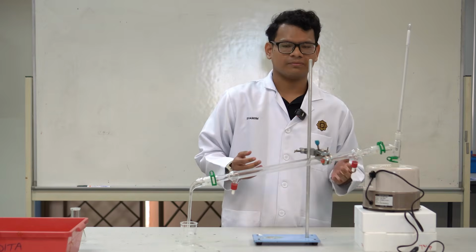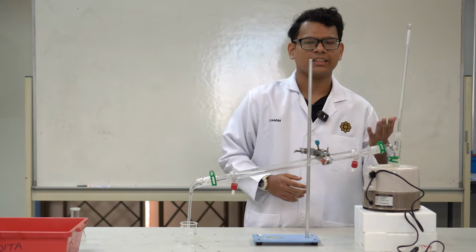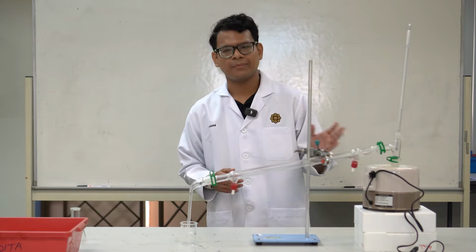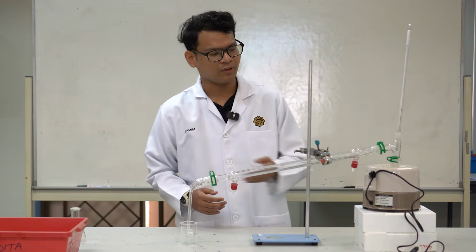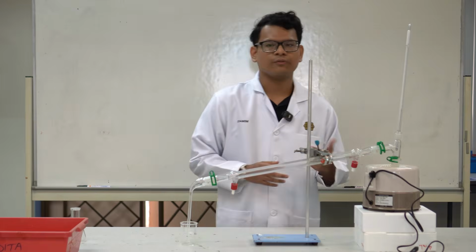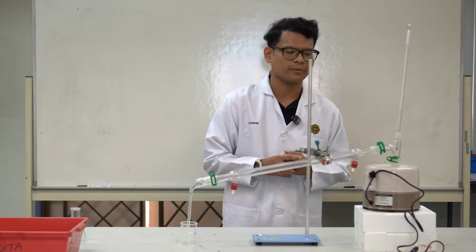Now I'm going to give you a short brief about simple distillation. First, the mixture is heated up until one of the components vaporizes. The vapor is then cooled down and condensed back into liquid form. Lastly, it will separate from the mixture before. This process relies on phase changes, liquid-vapor equilibrium, and the physical properties of each substance involved in the experiment.